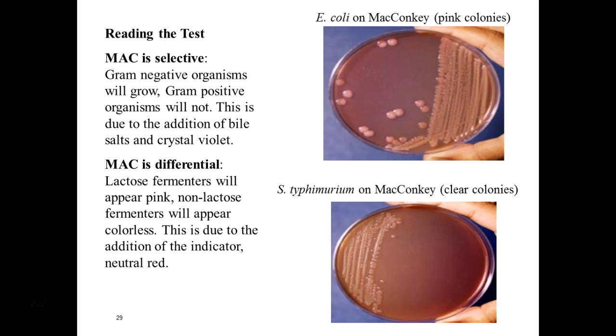And most bacteria that can ferment sugars are going to produce what common byproducts? What do we like that we can make from fermentation of sugar? Alcohol is one. But another one that starts with an A that you can use a pH indicator to test for, acids, right? And gases. So here, acids, when they're produced, just simply having a pH indicator like neutral red in the media is going to help us detect this byproduct of sugar fermentation.